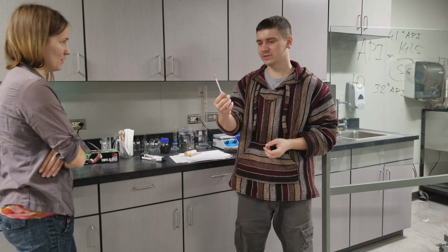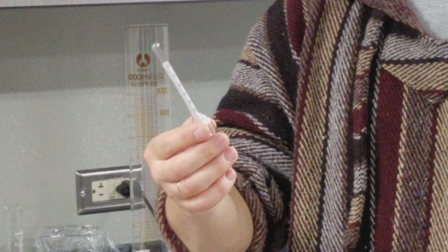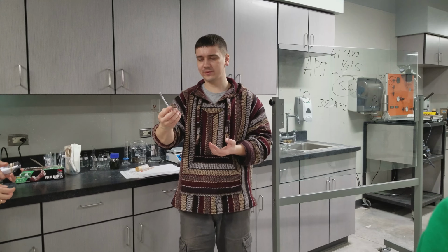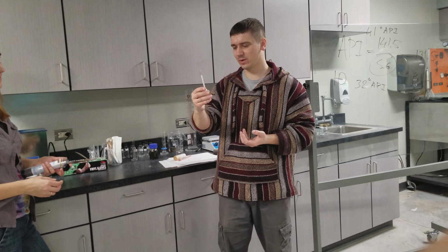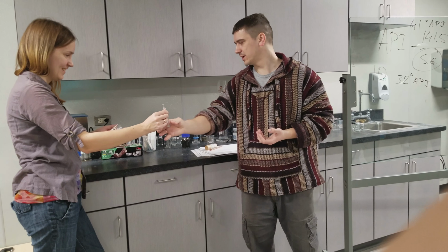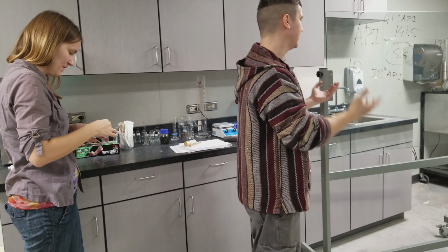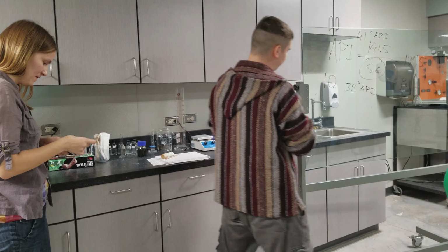Hydrometer. You just read the value, you write it down. I think you will be provided several different oils: vegetable oil, sunflower oil, corn oil. Water too. And yeah, just read it off. That was the fastest lab as far as I remember. Okay, so that takes care of the API or specific gravity, which is basically the same thing, right?